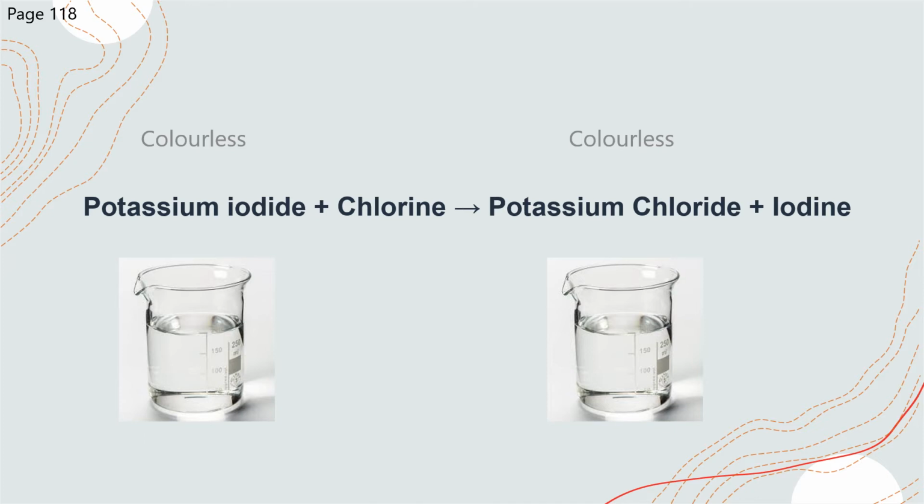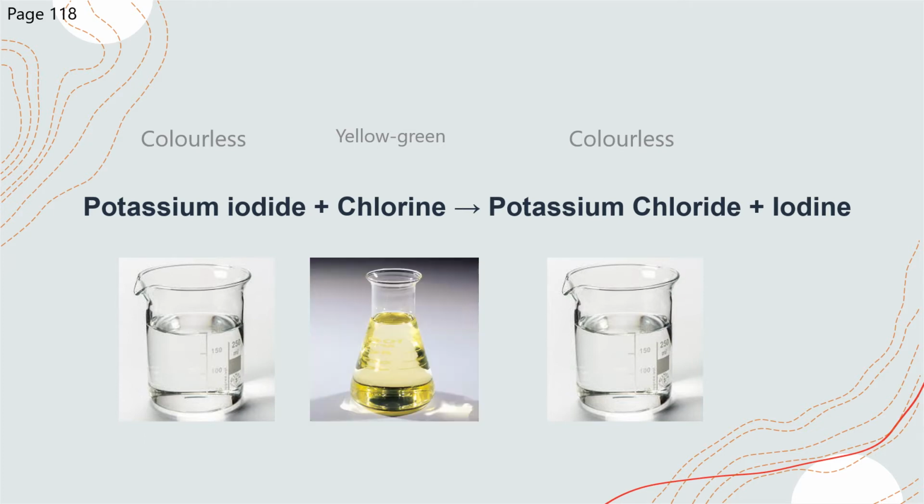Now, this is where the colours of our halogens matter. Imagine you start with colourless potassium iodide in a beaker. But you decide to add chlorine solution to it. Chlorine, remember, is a yellow-green colour, and it's a green solution. So imagine you're adding that yellow-green solution to the potassium iodide. Just like diluting juice changes the colour of water, this halogen will change the colour of the compound. So as you add the yellow-green solution, initially, you will see the colourless solution turn a pale yellow-green.